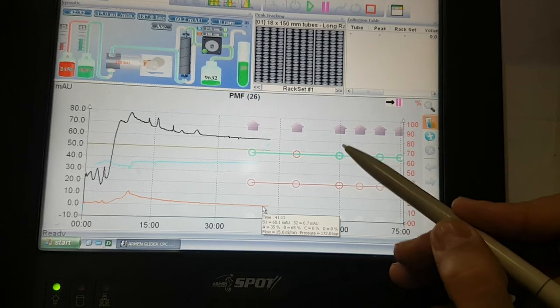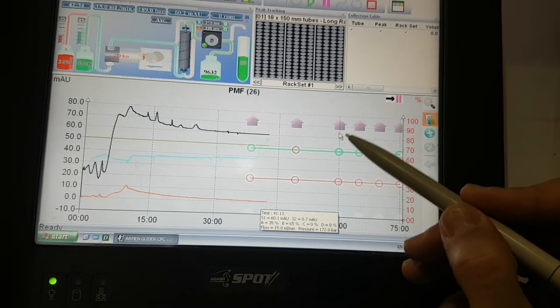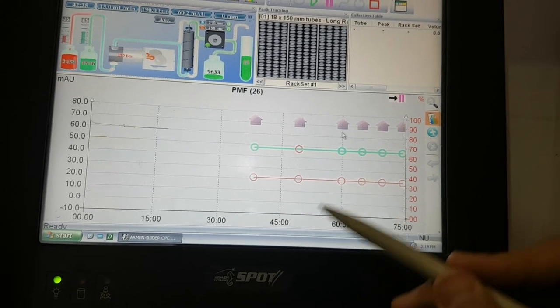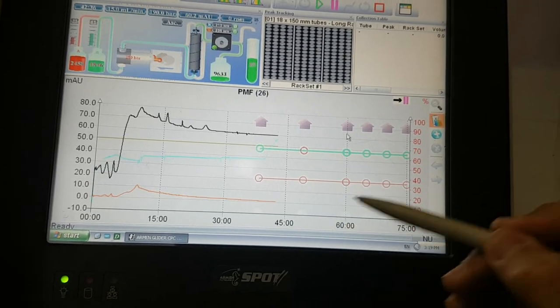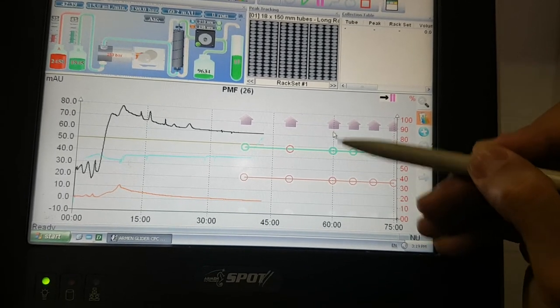Then we can inject our sample. For example, here we can inject.